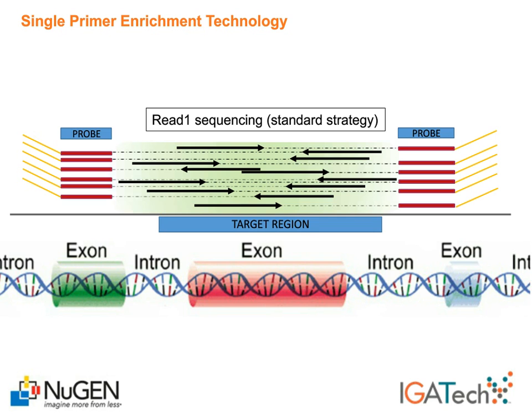They are the only ends that are going to be sequenced in the original system, looking for unknown or causative polymorphisms, or in other cases for structural variations.